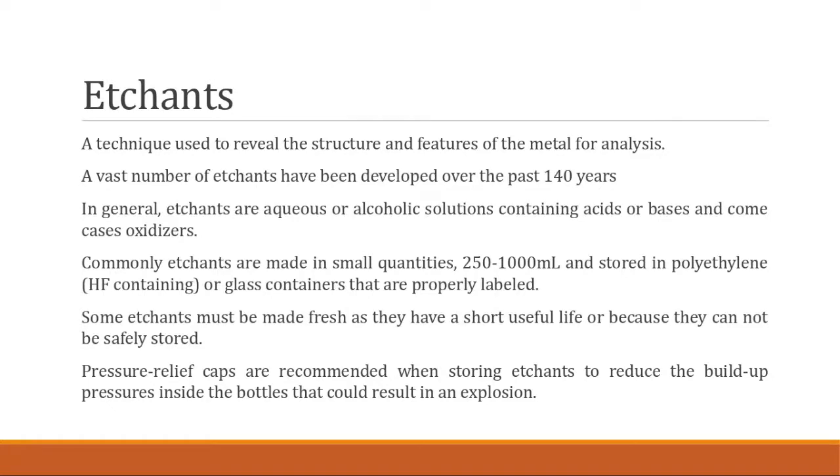Your common etchants are typically, like I said, in small quantities. You will not see etchants stored in greater than 1,000 milliliters, and they'll be stored in polyethylene. That would be anything containing hydrofluoric. Everything else can be stored in glass containers, and you have to have them properly labeled.